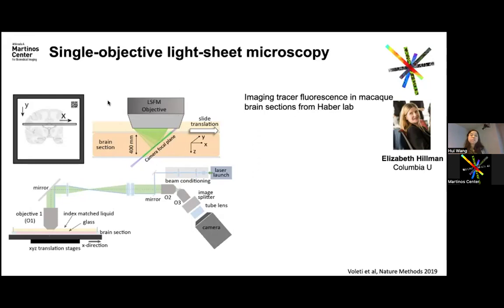And very nicely, this configuration is very similar to PSOCT in that it images the block face. It shines light from the top and collects light that fluoresces back to the objective and is collected by the camera. It can be integrated into an imaging and sectioning scheme, right? So potentially it can create a large volume of fluorescent images with the neuronal tracers.